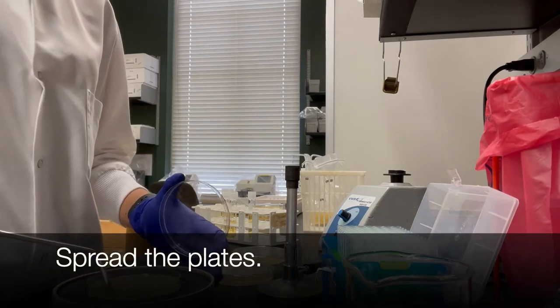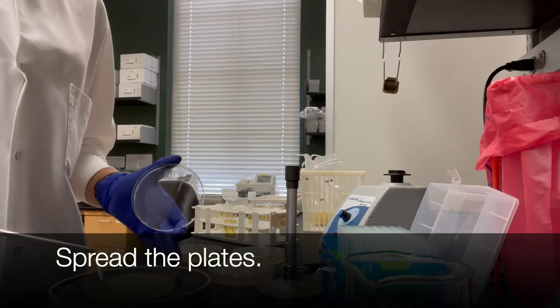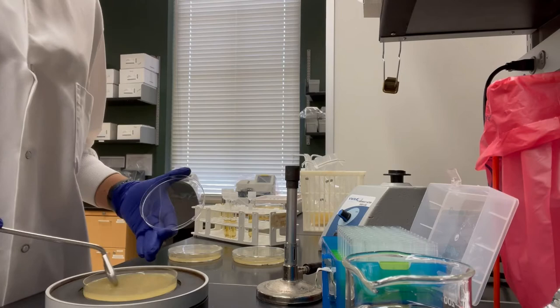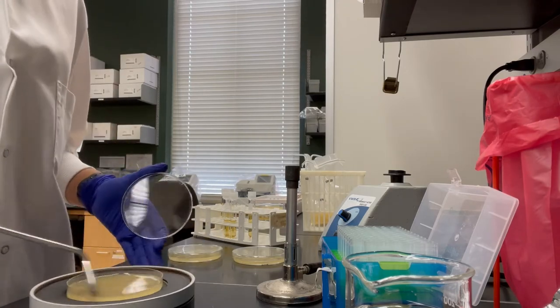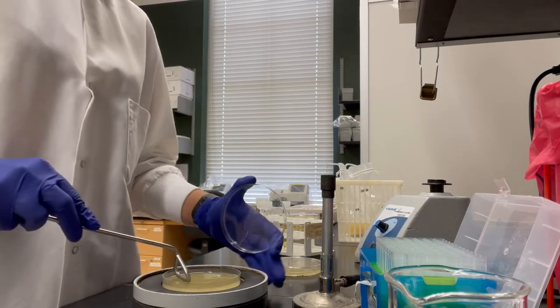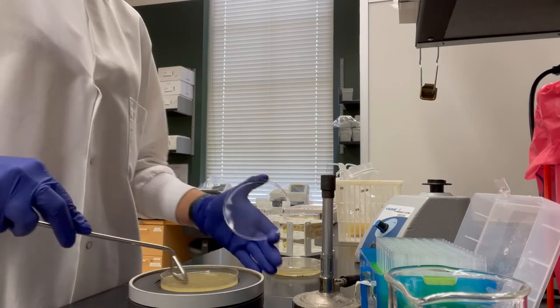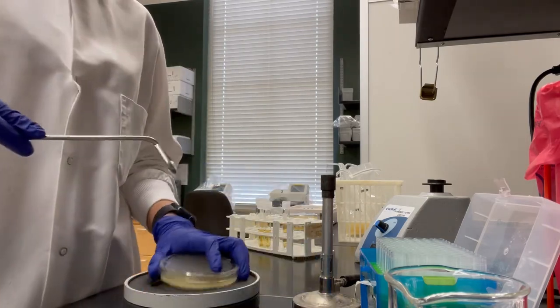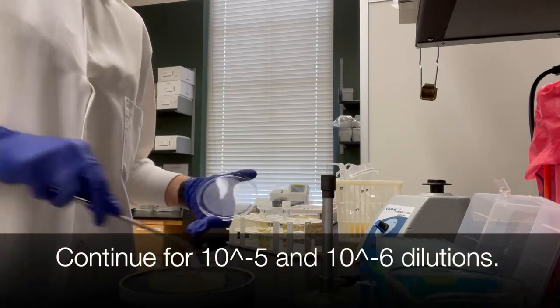Spread the plates like normal. Continue for dilutions 10 to the minus 5 and 10 to the minus 6.